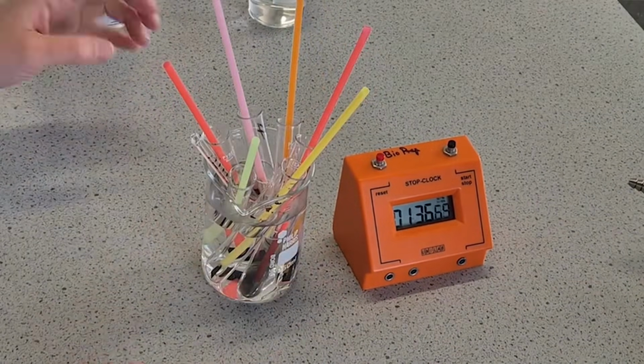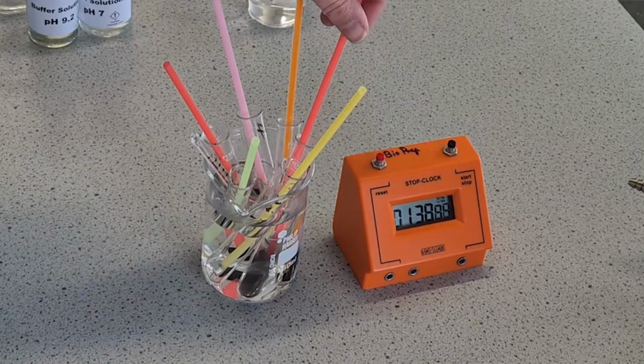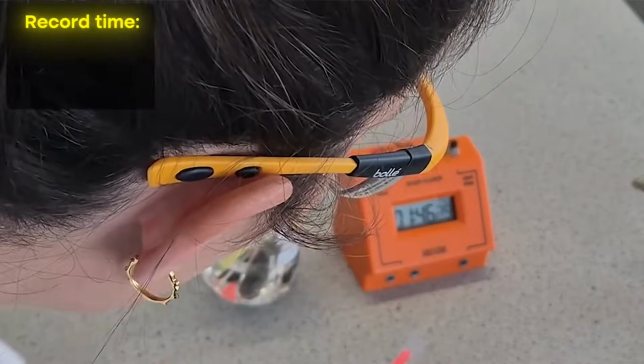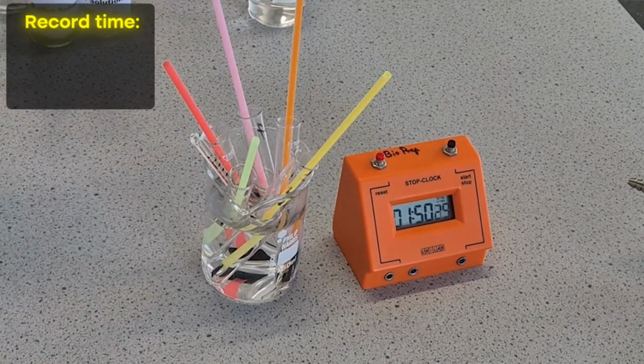Okay, and we do need to be quite quick on it because we can see this one. Let's compare it. Okay, so that one's already gone. So 1:46, 9.2. So that's our first one. And then the students will need to record down that time.